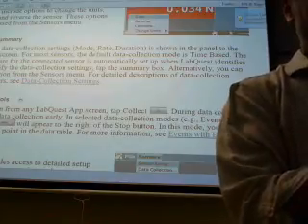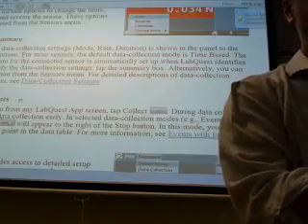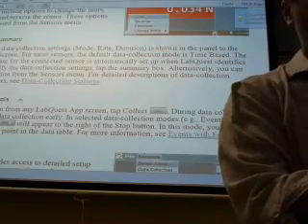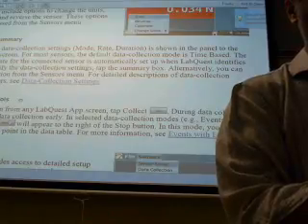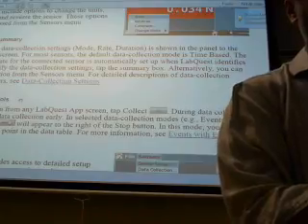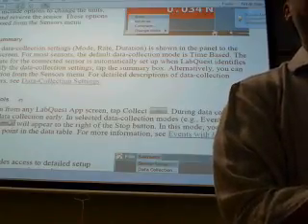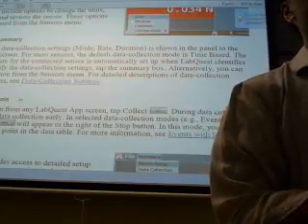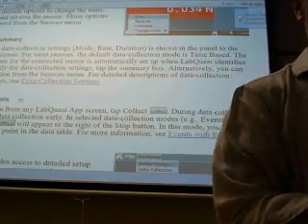Where do we go? Let's go back to the box, not file. Yeah, hit the meter. So we put last 100 or 80 seconds? 10 seconds. So what would be the duration? No, why don't you go ahead and you pick whatever you want. Okay, I'm gonna put 10. Maybe sample 10 temperatures per second or 2 temperatures per second, and then see what it looks like.